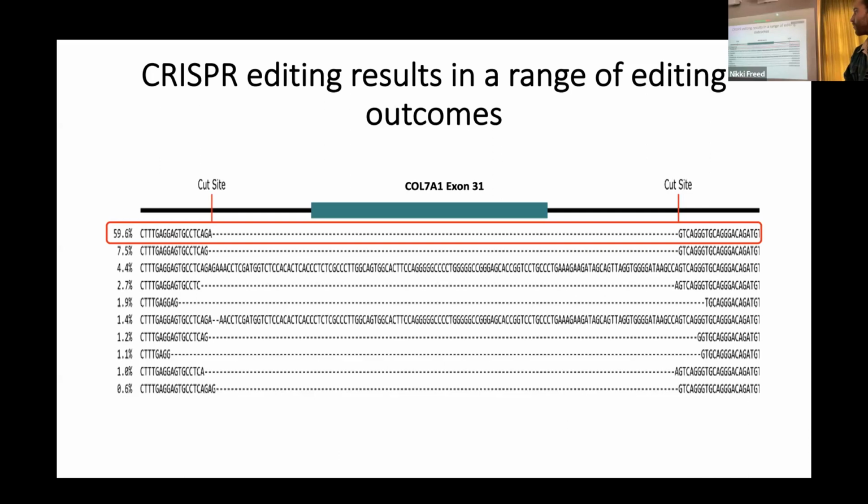And it's become relatively evident in the literature, and John actually wrote a review on this, that larger CRISPR editing events do occur, and sometimes at worryingly high frequencies. So we decided to perform some long-range nanopore sequencing across the same region. And of course, Nanopore is really fantastic for being able to identify these larger events.